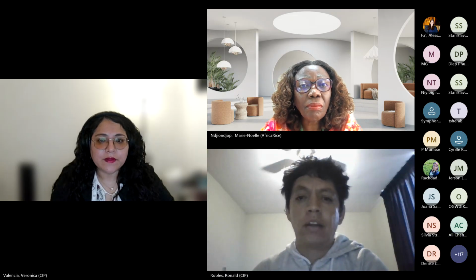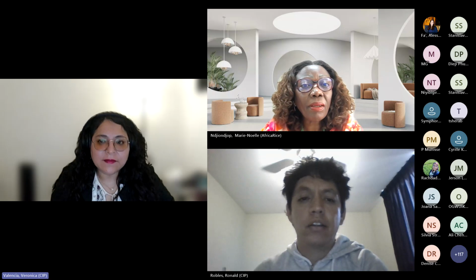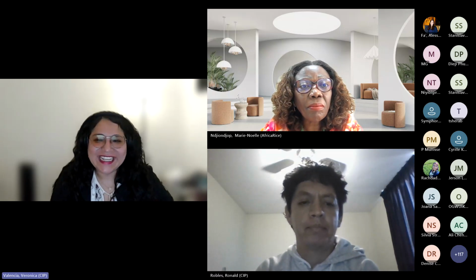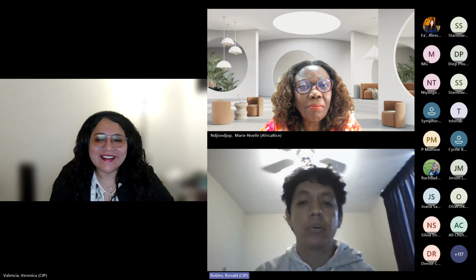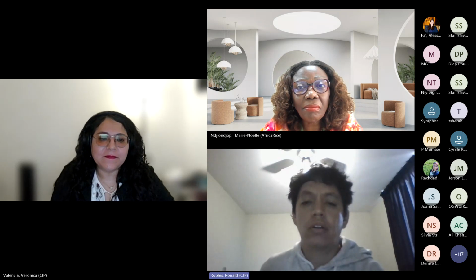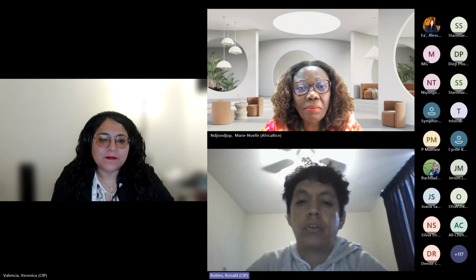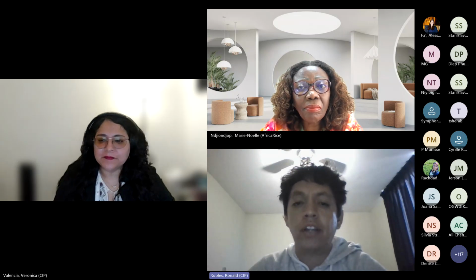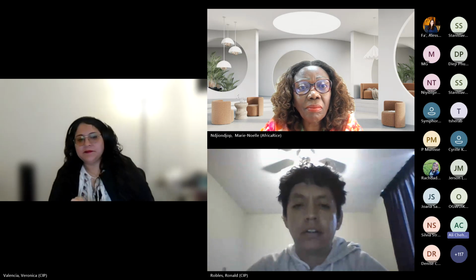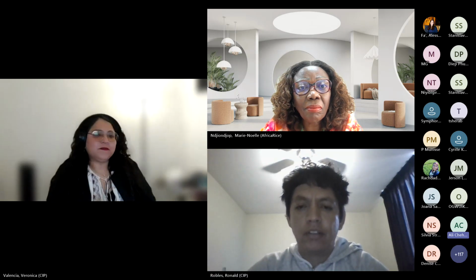Thank you. The other question was about how you treat your extraction protocol when it fails. I understand that. Yes, my second question is how to improve the quality of my collected DNA.